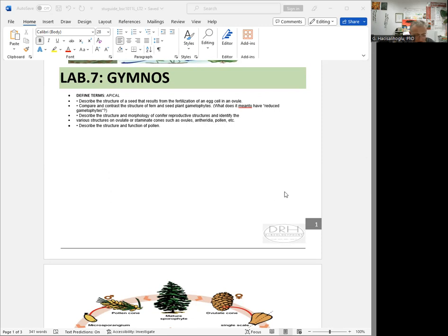What else here? The male gametophyte with pollen, pine pollen, is very unique, with 2 wings that look like a Mickey Mouse kind of shape. They have alternation of generations. We know that. A cone is also called strobili. They are heterosporous. They produce 2 types of spore. Ovules become seeds later. So the seed is unique here, which is actually new here.